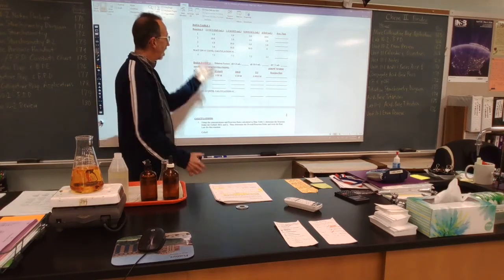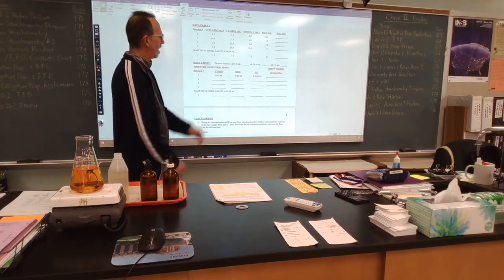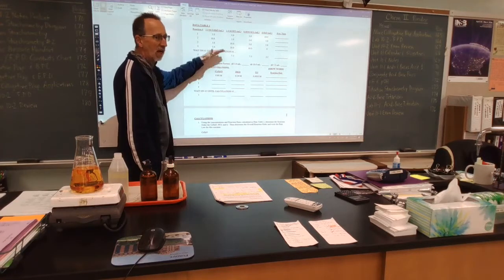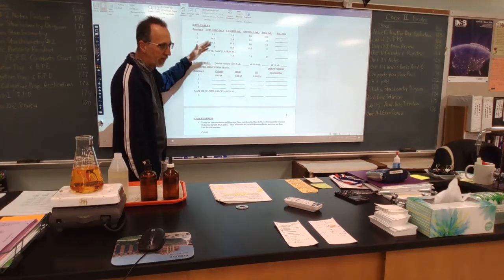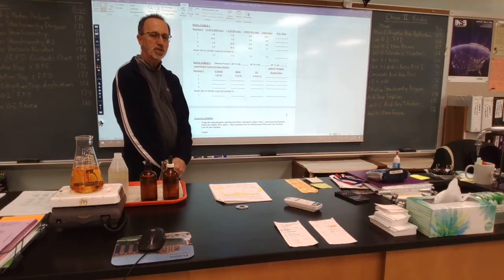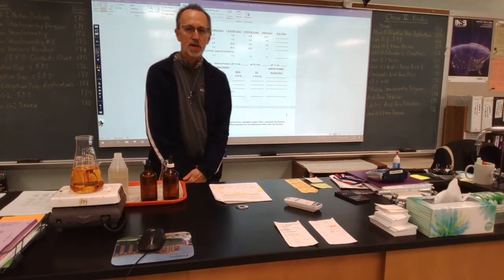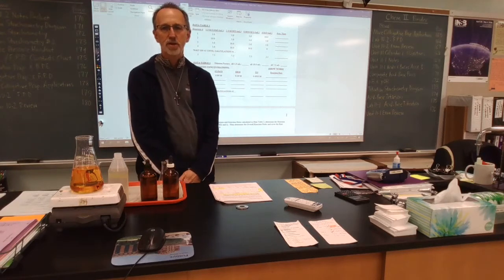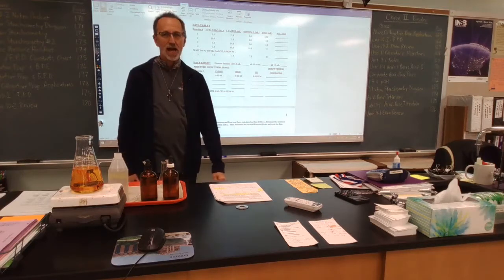So based on that, we use reactions 1 and 2 to determine the order for acetone. And as you look at the other combinations of reactions, 1 and 3 or 1 and 4 or 2 and 4 or whatever, you should determine which combination of reactions you would use to isolate the order for HCl and for iodine.